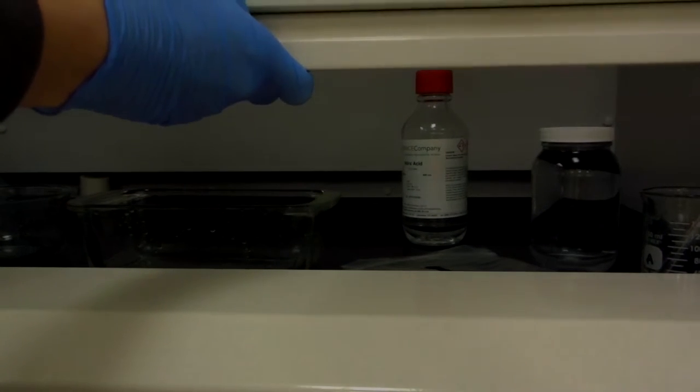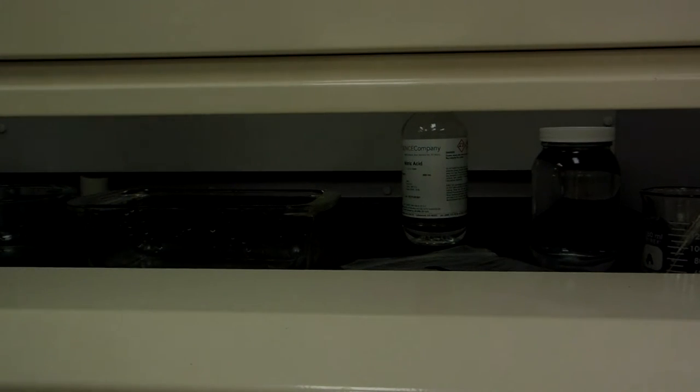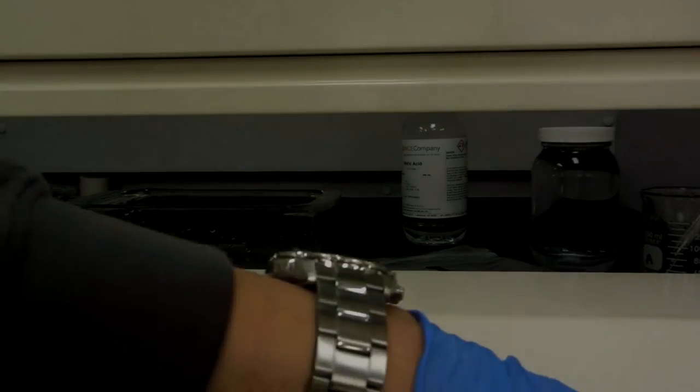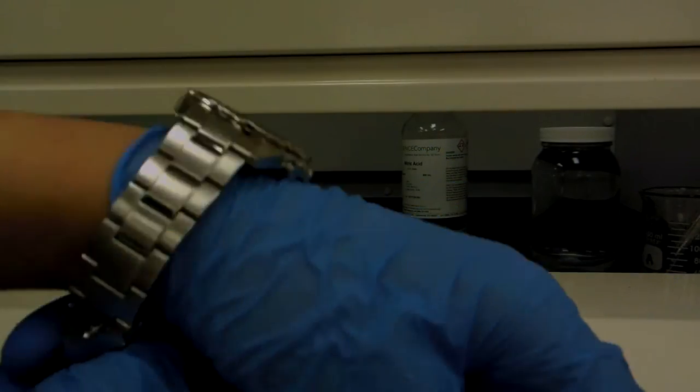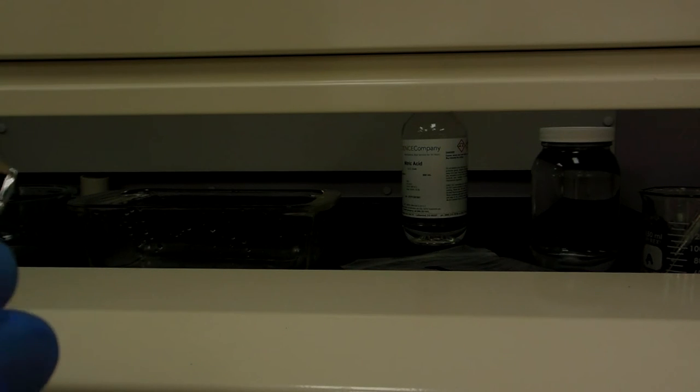Now I return to the fume hood and I lower the sash to force airflow and gases up and out of the fume hood. The first thing I want to do is take off any jewelry I have on my wrists and arms, as you don't want them to be damaged from the acid or cause any unwanted reactions that could be potentially dangerous to your health.